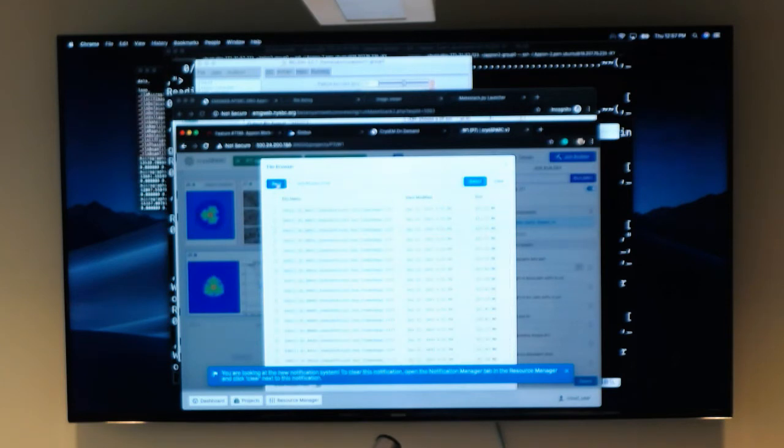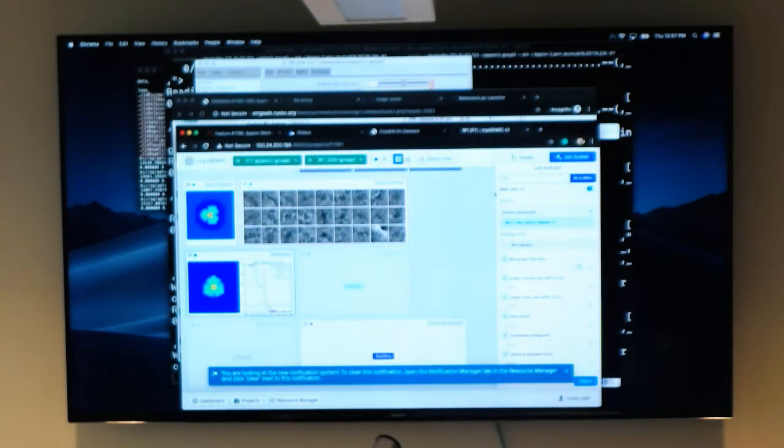If you have moved along, we have a couple of other data sets. We have an EMPIAR data set with aligned sums, and we also have a movie stack. So if you finish this tutorial and there are other data sets where you want to go from micrographs forward, you can.